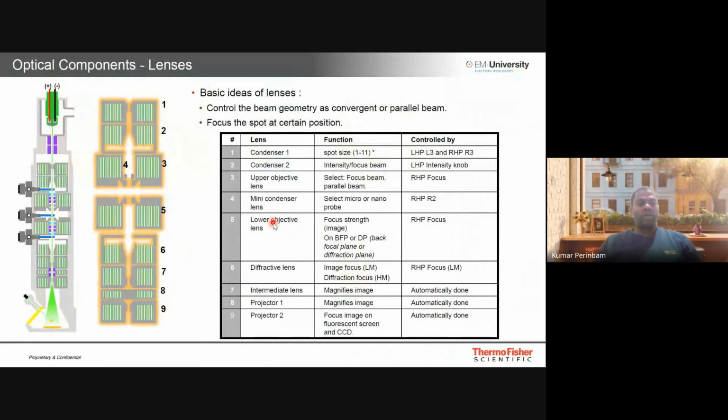So this is a lot of information. You don't have to know every bit of it, but all that you have to know is that there are multiple condensers currently being used in a high-end electron microscope. It's a kind of switch or knob which helps you tweak the electron beam to make it as coherent, as uniform, and as focused as possible before hitting the samples.